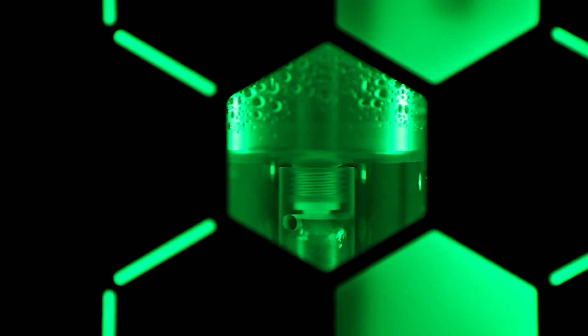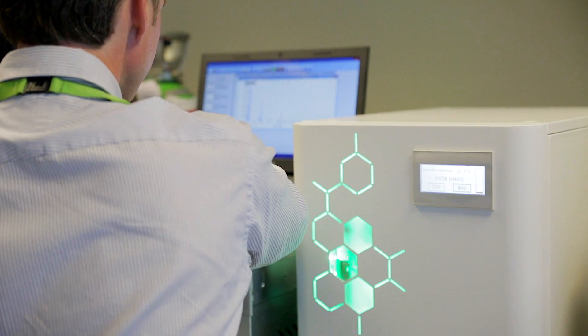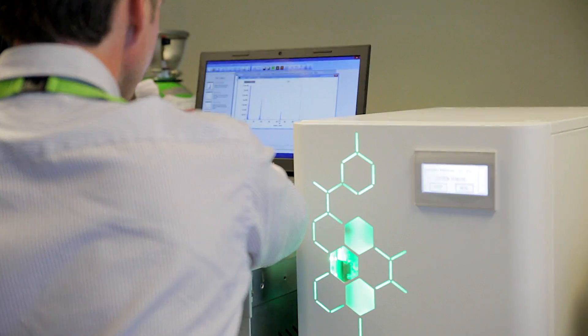What the generator offers is gas on demand 24-7. As long as they have electricity to supply to the generator, they're not going to have the same potential issues that they have with cylinders, reducing the number of times that you need to break the connection between the gas source and your instrument.